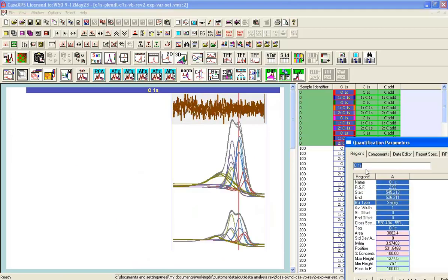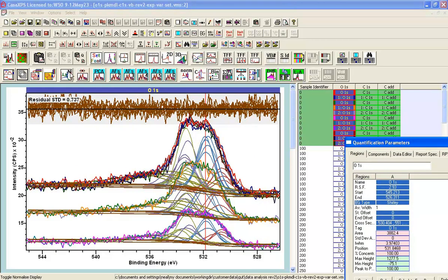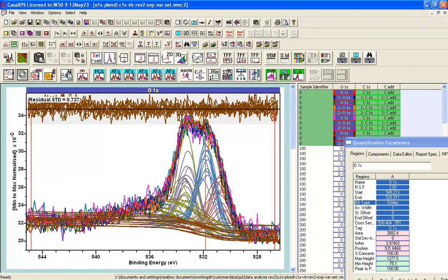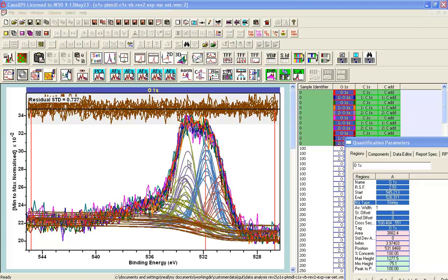It's very evident from these results that despite a good mathematical fit — as implied by the residuals — the peak models are failing to produce a physically significant fit of components to the data that can be interpreted in terms of the chemical states described in the literature. The reason it's failing is because the spectra are too noisy and there's not enough shape information to achieve a physically meaningful fit.